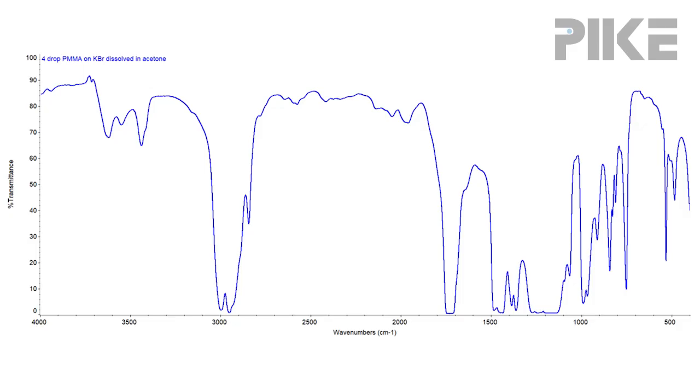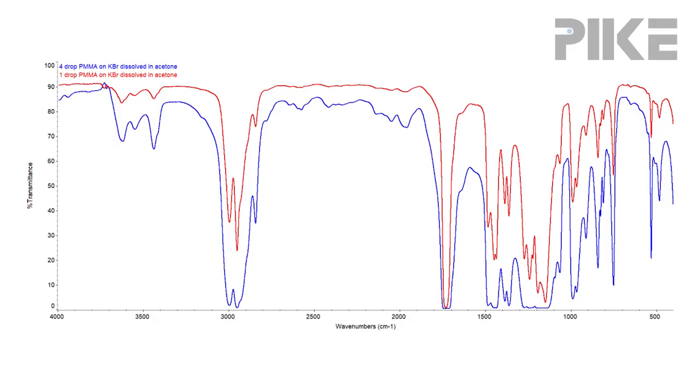So let's take a look at my casted films. On my first attempt, I put four drops onto the KBr window, but I noticed the bands are too saturating. So I tried one more time and only put one drop on, and you can see that is the red spectrum — that looks much better.